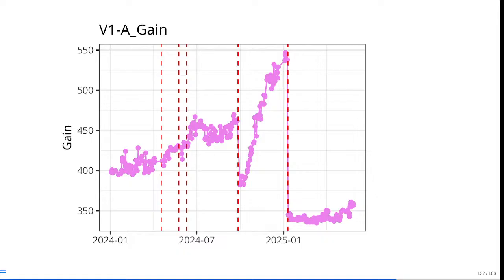So in this case, for this particular instrument, I think this was our Aurora tree, we could see the gain start to spike on the violet laser, and we were able to call our field service engineer to come out about a month in advance of when they actually started triggering the Cytek Aurora QC fails, because at that point we had a cue of, hey, this laser is starting to burn out, the gain is constantly being ramped up. So this is one of those advantages of having tinkered around and figuring out how we can extract this little metadata about the detectors and about the actual voltages to be useful.